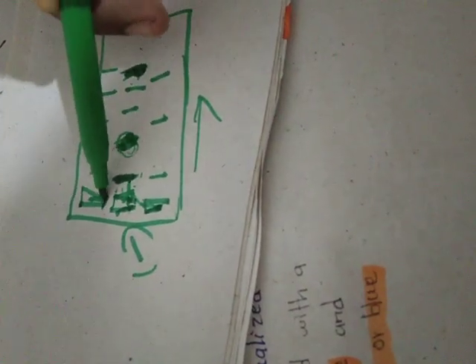That is the separation of DNA fragments. At first, all are in the wells. Then when we apply the current, they are separated like this. That's why the fourth step is, after applying the current, the separation of DNA fragments.